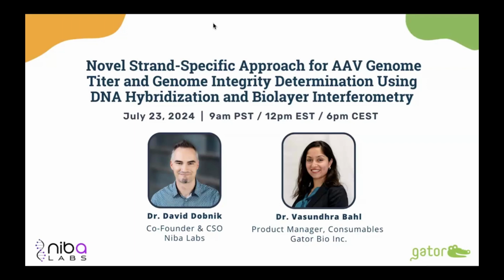Okay. And follow up, do you have any thoughts on doing RNA hybridization with BLI? Yes, we do. So that's in very early stages, and it's not on the way to being a product yet. But yes, we are looking into it, and we do have plans of doing that.